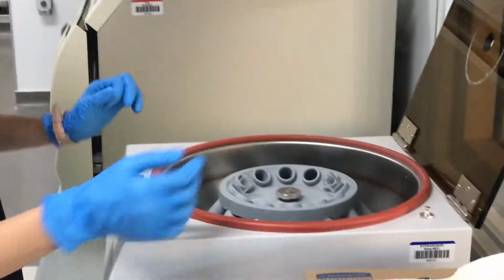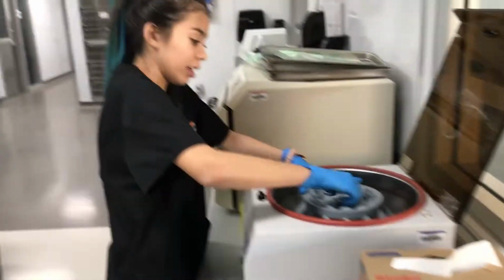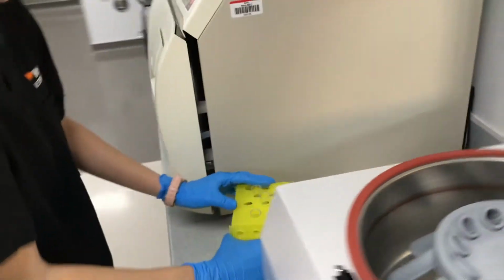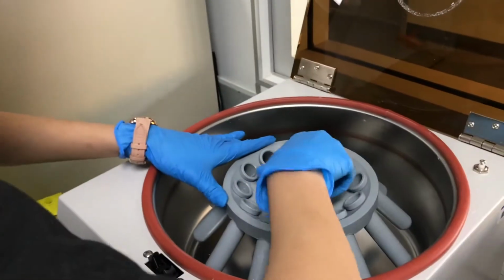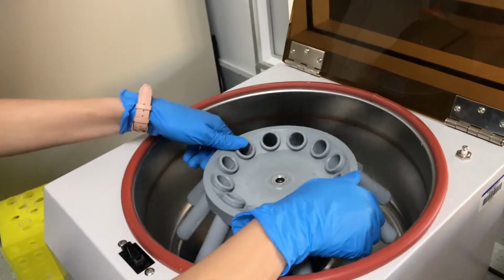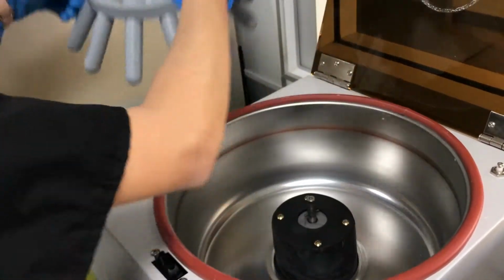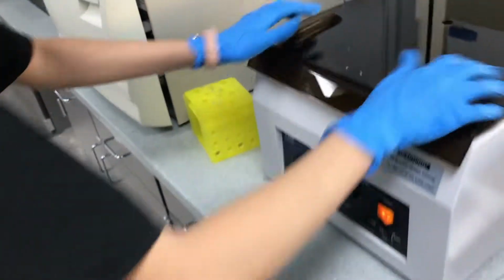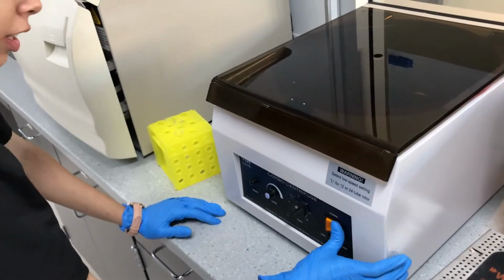Okay, so after the 10 minutes are done, I will take my conical tubes out and put them onto my test tube rack, and I will take this off and remove this and close this back up, and I'm going to turn this off.